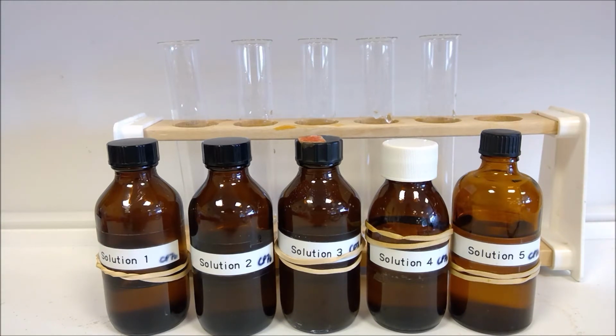On the addition of acid, if one of our unknowns contains a carbonate ion, we would see effervescence, so we can note that down as well. And then once we've finished testing for the halide ions, we will then go through and test for sulfate ions afterwards by adding barium chloride to separate samples of the solution. So make sure you've got a suitably designed results table ready, and then you can record the observations as we go through.